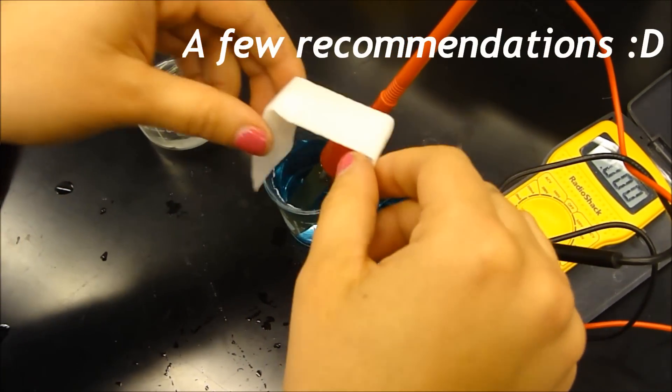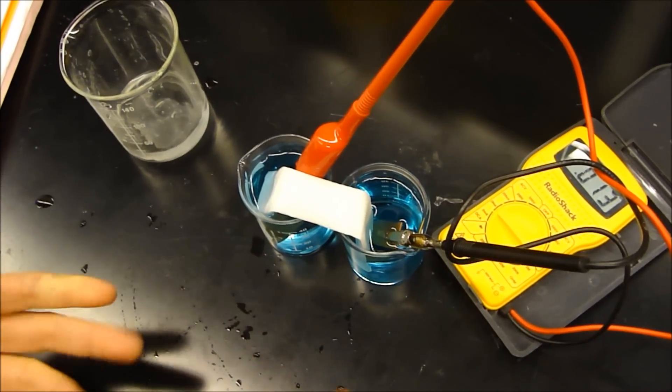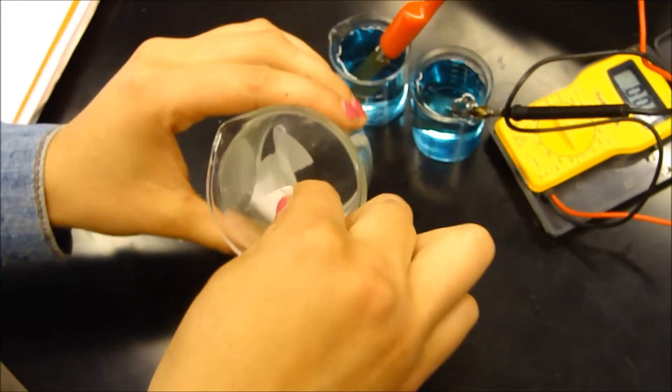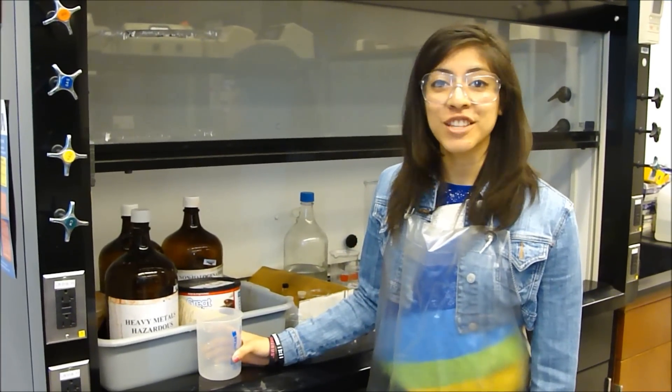Whenever you connect your salt bridge to the beakers, make sure that it touches each solution, because that is the only way that ions can pass through. Note that you need a new salt bridge for each battery that you make. Don't forget to soak it in potassium nitrate. Lastly, don't forget to dispense your waste in the heavy metals container. I really hope this video helped you in some way, and after this lab, you're done.